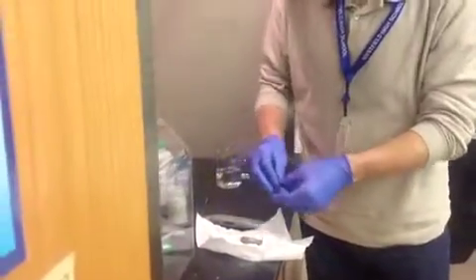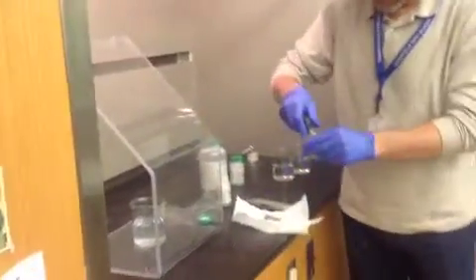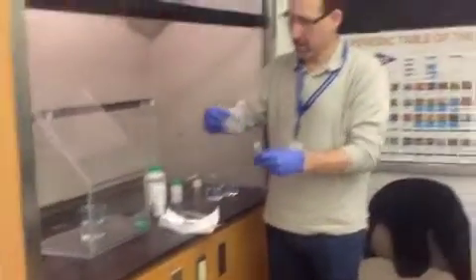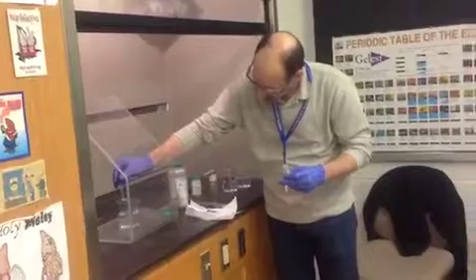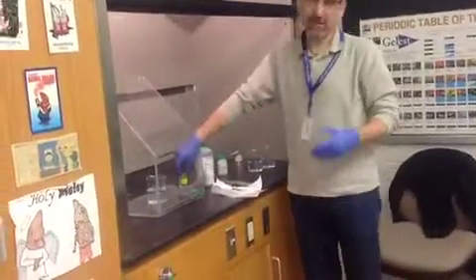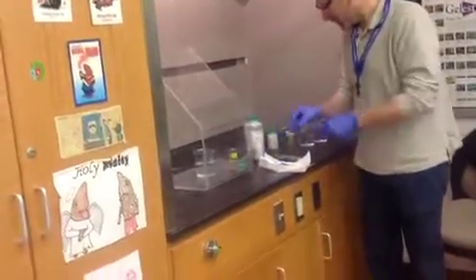If I put it in water, something special is going to happen. I'm going to put a little indicator. This is something called an indicator. We'll talk about this later on in the year. It's going to change colors to show that a reaction has taken place. But you're going to see other evidence of a reaction taking place in here as well.